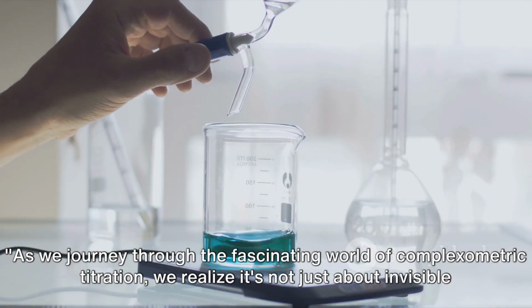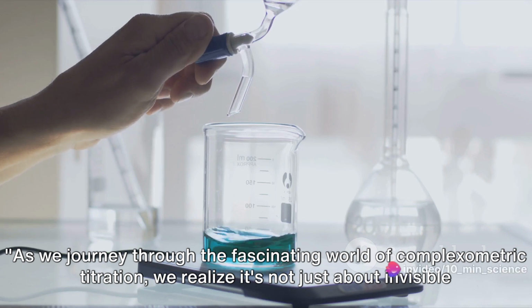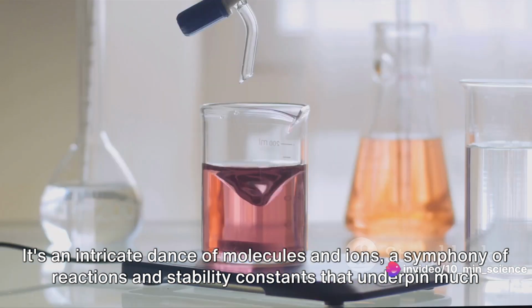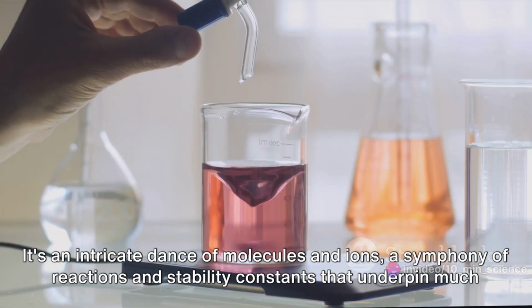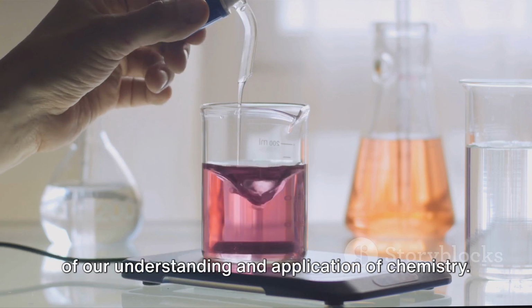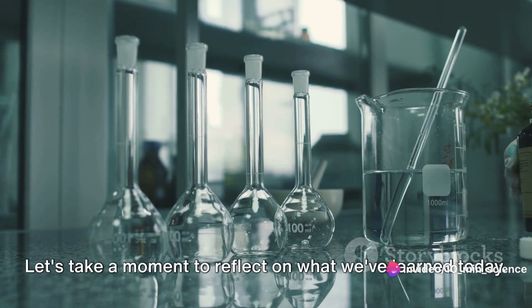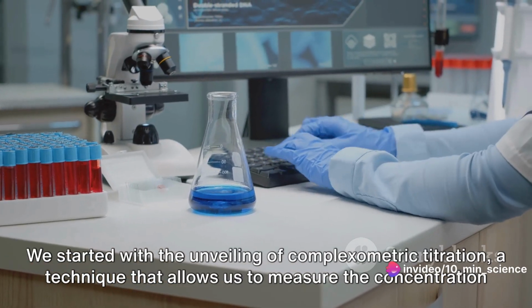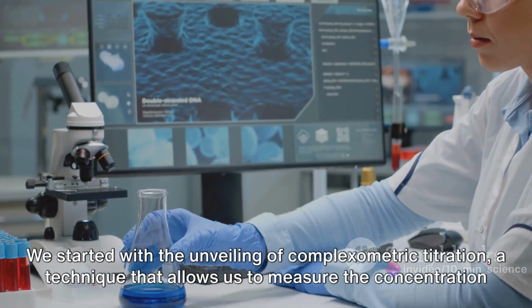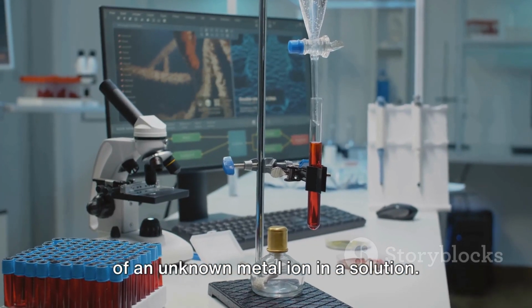As we journey through the fascinating world of complexometric titration, we realize it's not just about invisible needles and traffic lights. It's an intricate dance of molecules and ions, a symphony of reactions and stability constants that underpin much of our understanding and application of chemistry. Let's take a moment to reflect on what we've learned today. We started with the unveiling of complexometric titration, a technique that allows us to measure the concentration of an unknown metal ion in a solution.